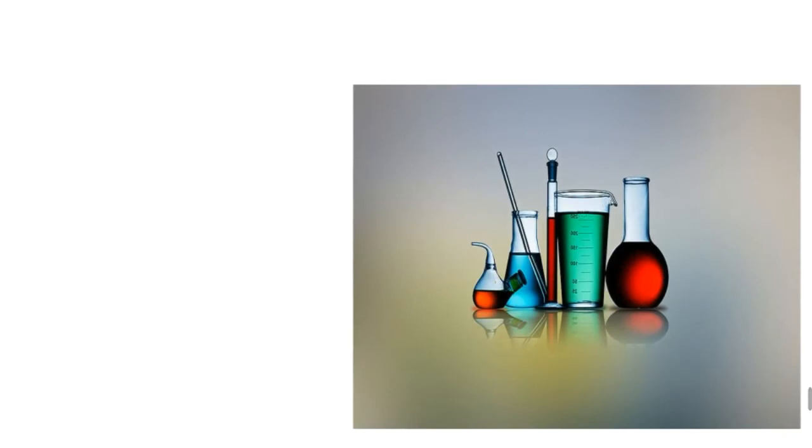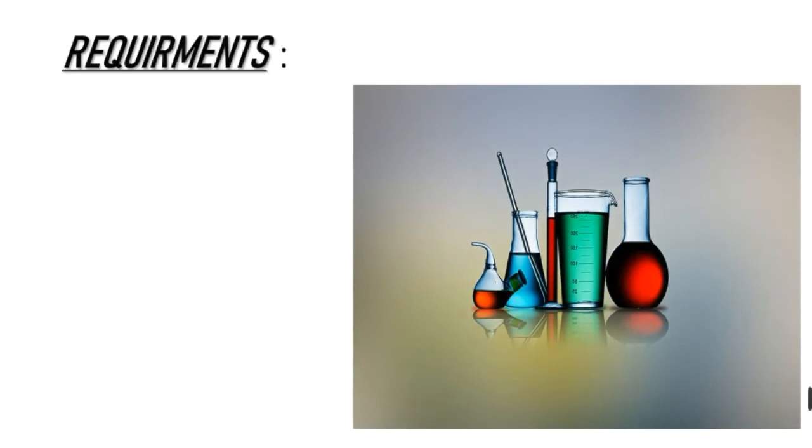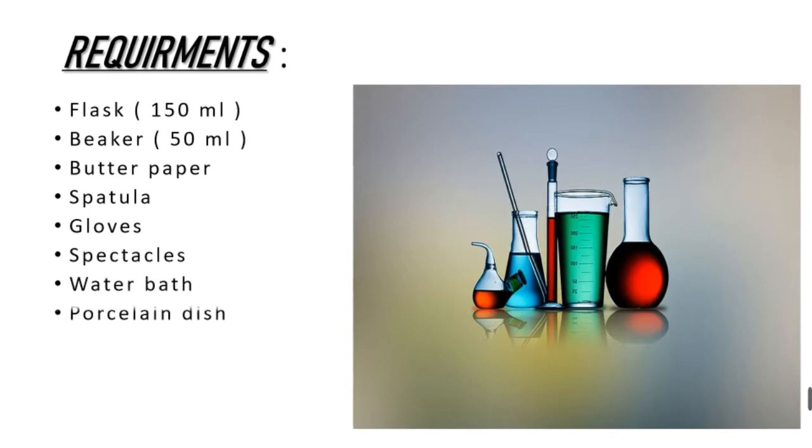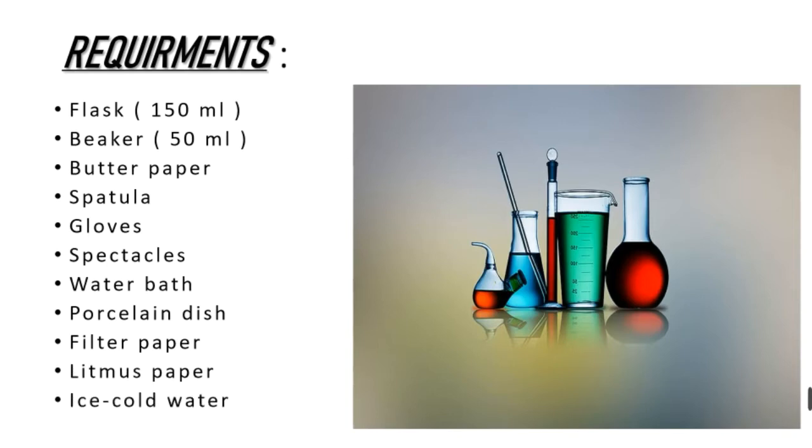Further, moving towards the requirements for doing this practical: flask, beaker, butter paper, spatula, gloves, spectacles, water bath, porcelain dish, filter paper, litmus paper, ice cold water, and charcoal. Further, moving towards the principle.